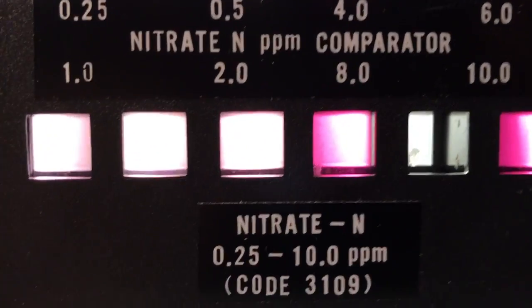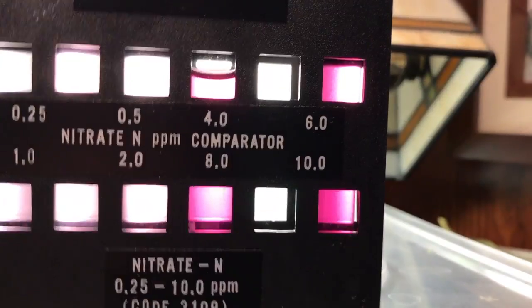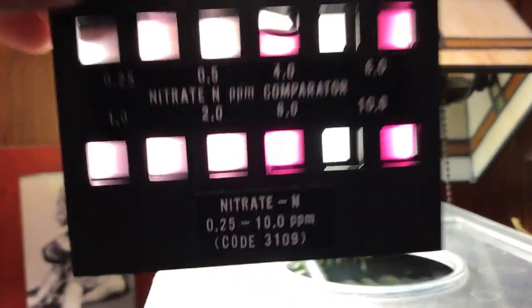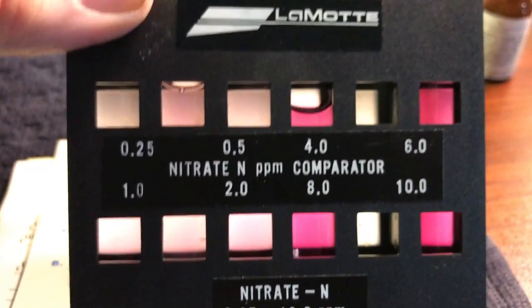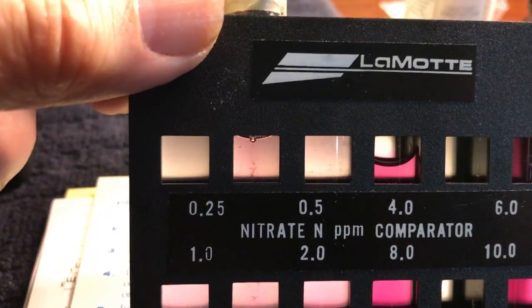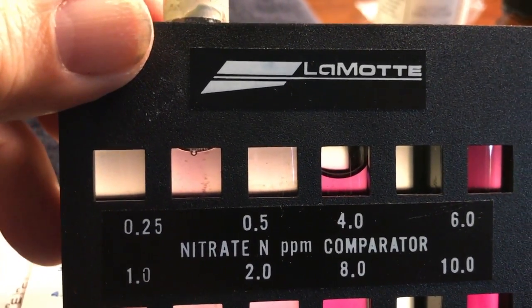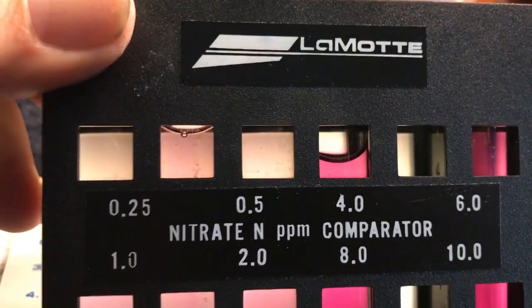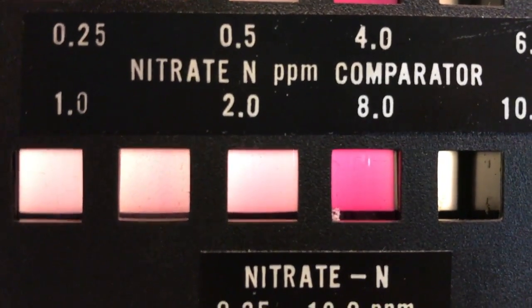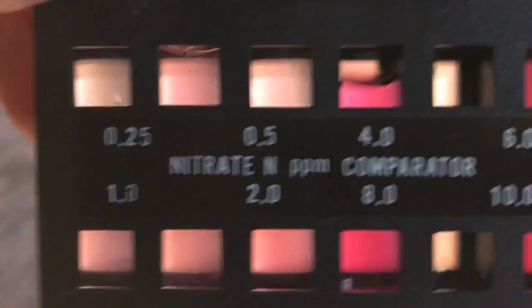I'm testing my aquarium with a Lamotte test kit right now, as you can see. I apologize — my camera isn't that great. It takes ten minutes for this to settle, but as you can see it's about 1.5 parts per million. It doesn't quite match the 0.25 or 0.5 references — it mainly goes between one and two. This is nine months old using the anoxic filter, and it's not quite two and not quite one — I'd say 1.5 parts per million.